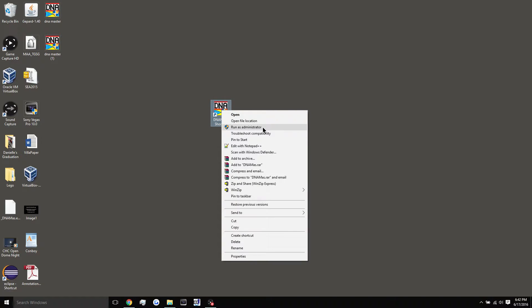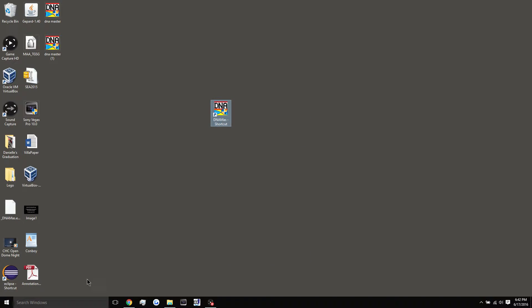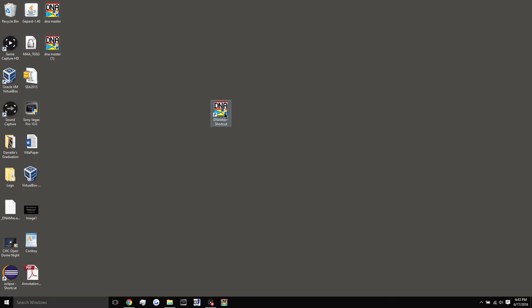This will create a thing that will allow you to run DNA master each time. What you can also do is pin it to maybe your start or even drag a shortcut down here, pin to task bar, and that will allow you to use DNA master more easily and load it up.